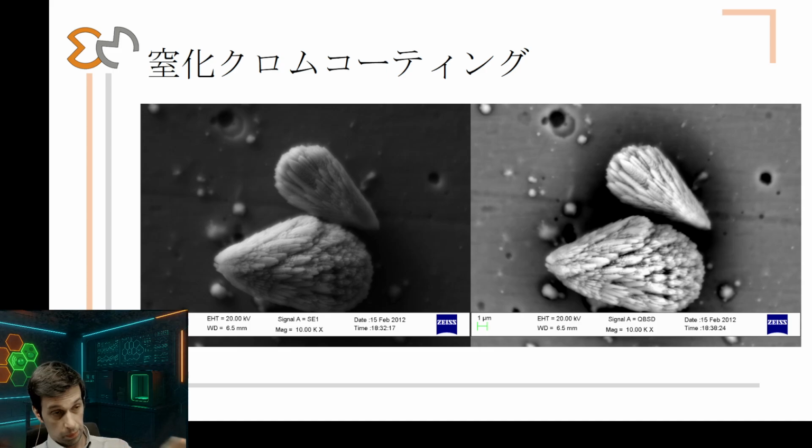The particles are whiter on the top left corner. This is because the detector of the secondary electrons is in the top left. By this effect, it gives us a very three-dimensional idea of how round the particle is, what the shape of the particle is. You can also see the holes in the coating a little bit in the back.